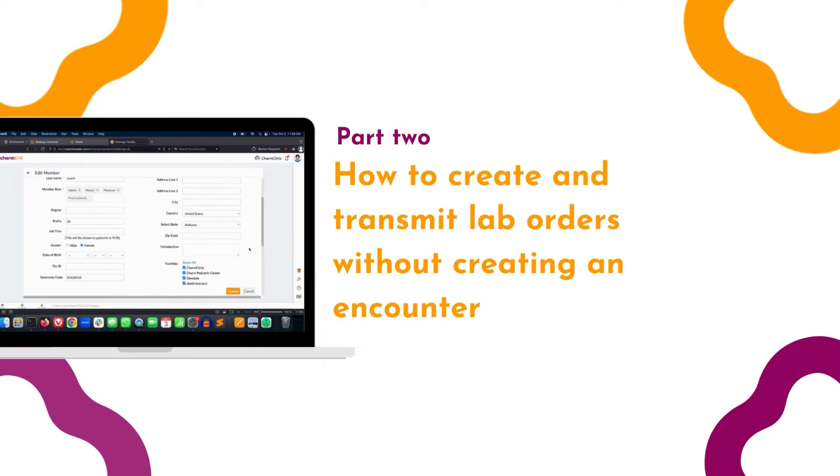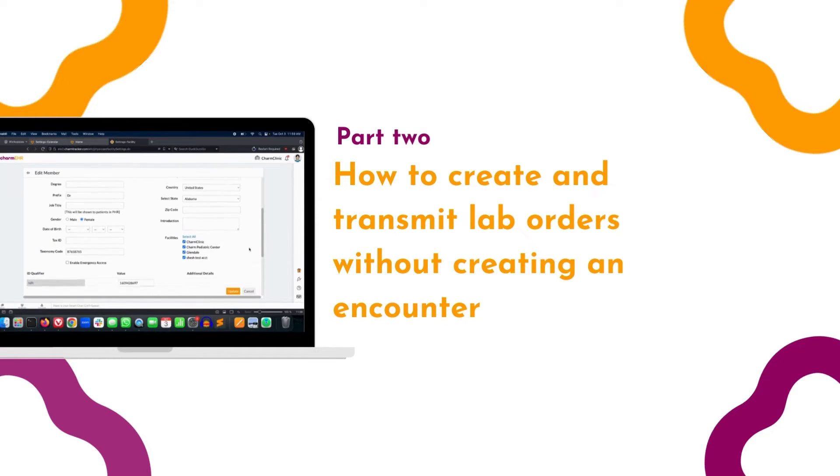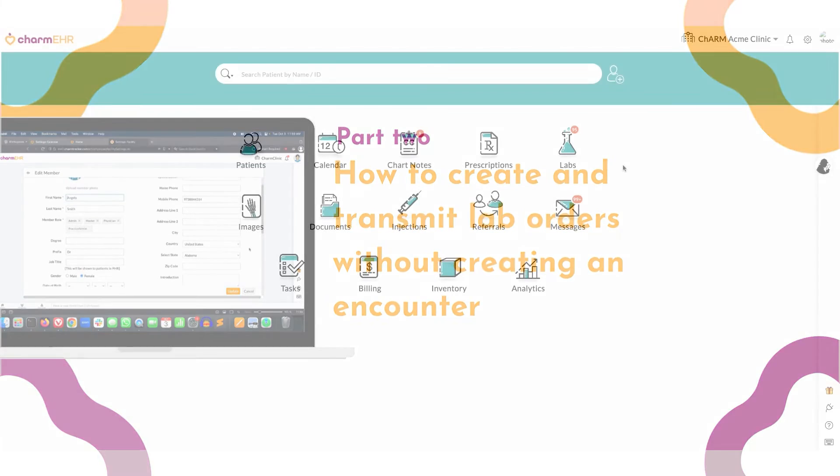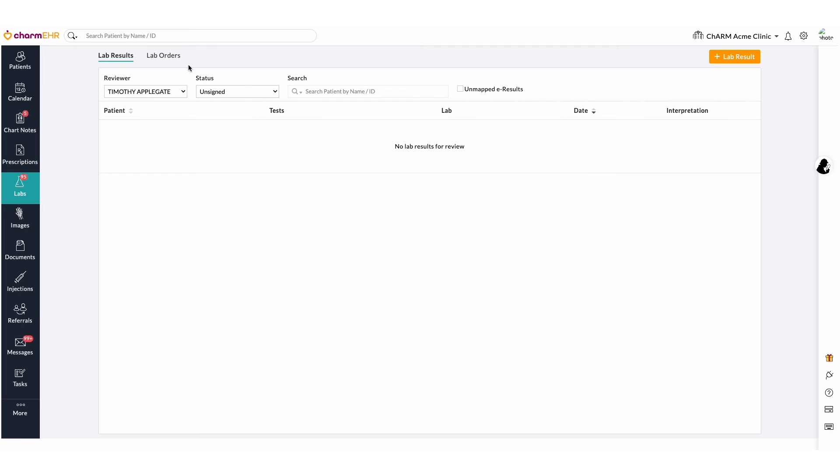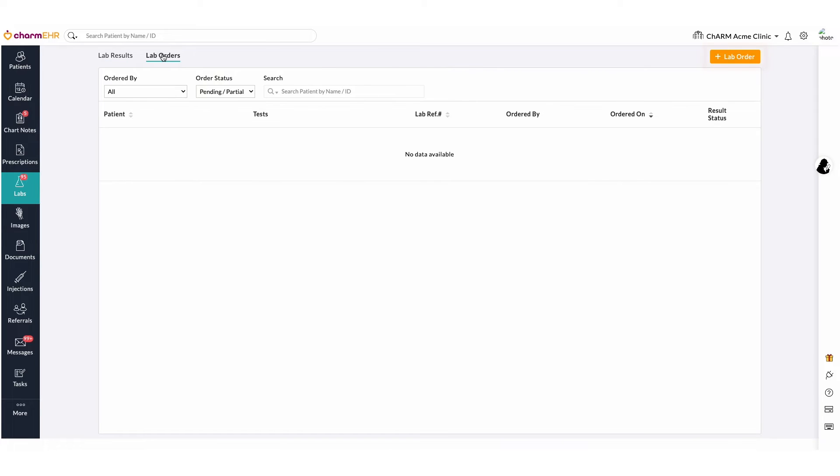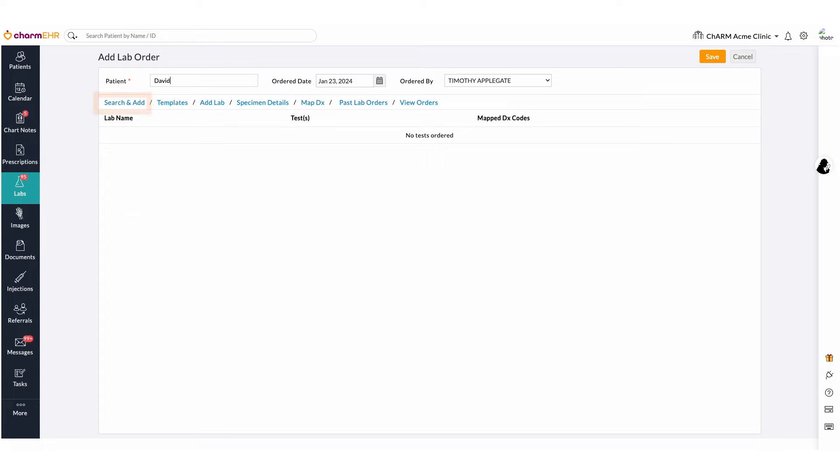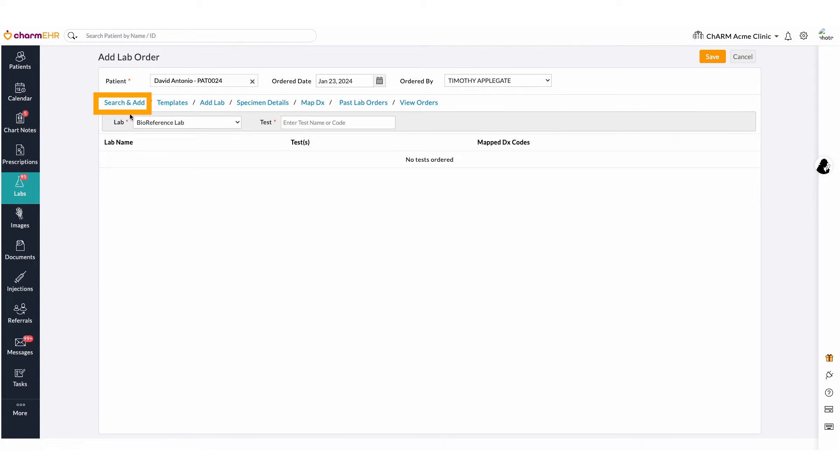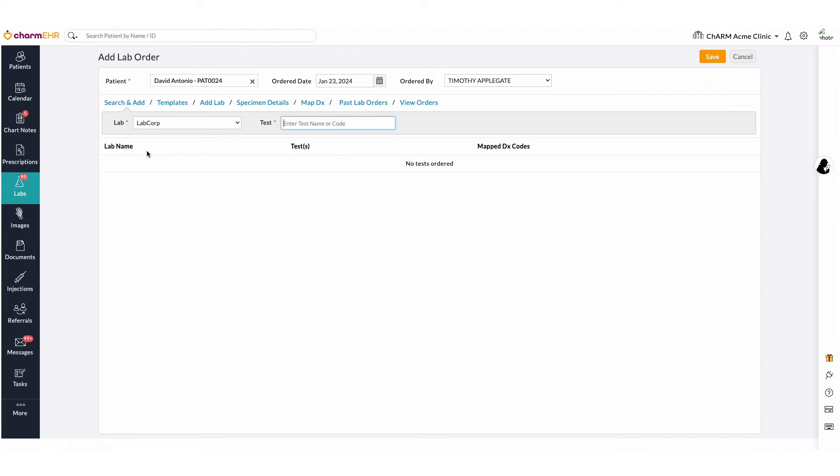Creating and Transmitting Lab Orders section without creating an encounter. Lab orders can be added without an encounter from the Lab Order section using the Plus Lab Order section. Search for the required patient and then select the Search and Add option to find your lab and tests you are looking for.